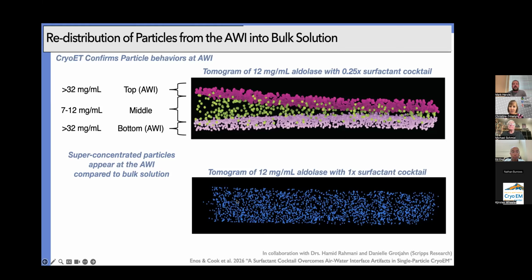I think there is a limitation on what concentrations we can use, because eventually you will start to rip off the belt protein or something. The other caveat is that the people we've approached to use their problematic IMPs in nanodiscs are also using antibodies to help kick views. And so we have to be careful about not kicking off the antibodies that they need for reconstructing the object and breaking the pseudosymmetry. That's kind of where we're at right now.